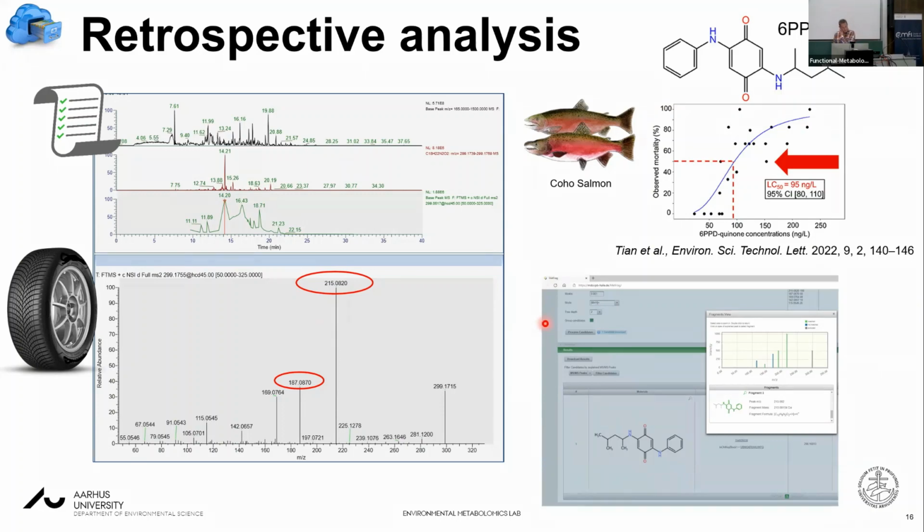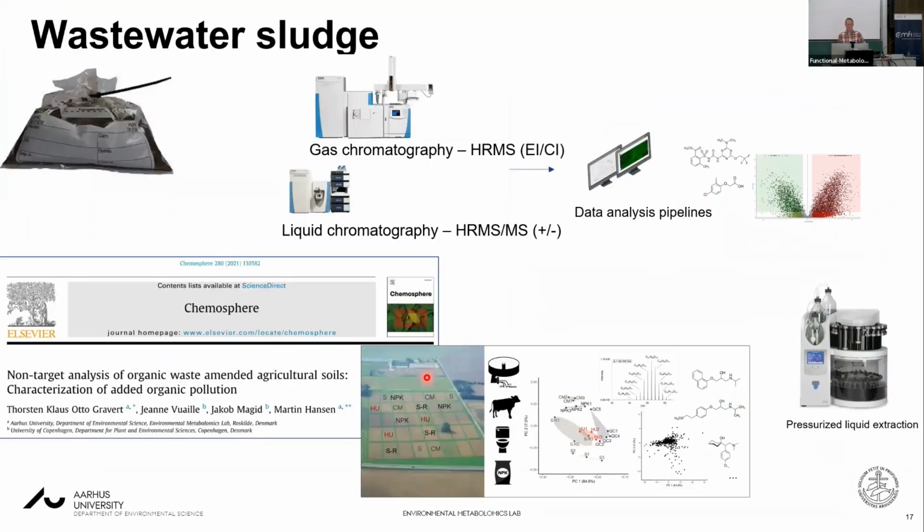In this case, it's MetFrag, and it matches with the fragments that we have. So we could say that this is a level 2 substance, and it's highly likely present in the sample, and we could quantify it. It was not around 95 nanograms per liter locally, so there are still trout in the rivers.